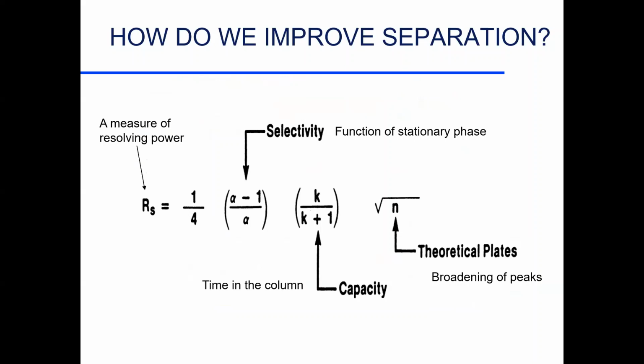So detectors, they're extremely important to us, and we've got some nice tools. Our problem oftentimes, though, is the idea of how do we separate? How well do we separate? And we like to do that by the column. Ideally, let's not make life difficult. Let's try to get one compound per peak, okay? And we can do that much of the time, but not all the time.